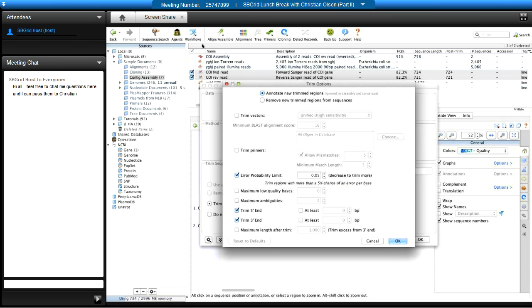Geneious will ask how you'd like to trim: you can perform a 'soft trim' which annotates low-quality regions according to your quality threshold — those nucleotides are kept but ignored for downstream analyses — or permanently remove the trimmed regions. Notably, you can trim vector sequence using UniVec, trim primer sequence, set an error probability limit, and specify trimming of the five-prime or three-prime ends.